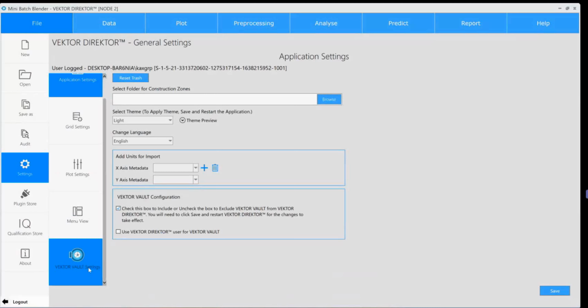So send that to Vector Vault, somebody approves that, and now you can use a Python script in a GMP setting because it's been signed off by somebody local saying that, yep, they've approved that it's doing the right thing, it's doing what it should do in the process. It's also a version control repository, so Vector Vault is going to record every life cycle of your asset so that you can come back and download it and see what happened, who did what, when, etc.